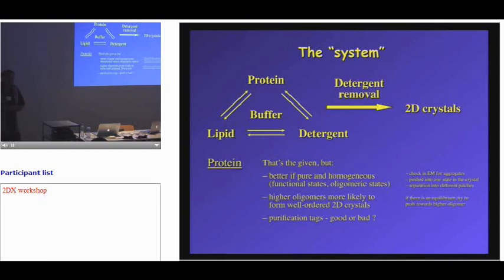Photosystem 2, yes, that's the example I mentioned. If you remove the phosphatidylglycerol, the monomer is unstable. There are also higher-order arrays, with functional implications for having more than one dimer, a macromolecular array. But my basic view is that while I used to throw away everything that was not one nice oligomeric state and say it would never crystallize, it's still worth trying to make 2D crystals, because it may crystallize.